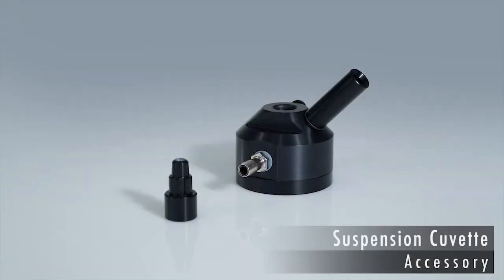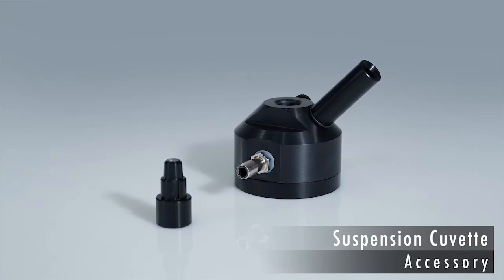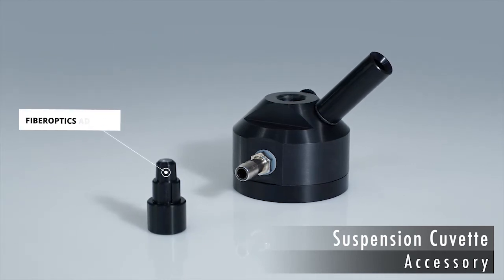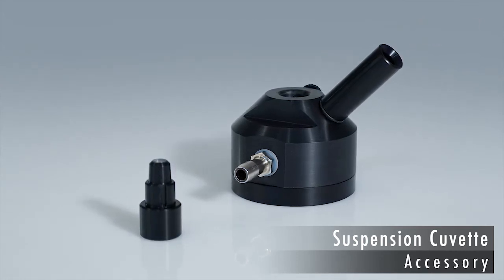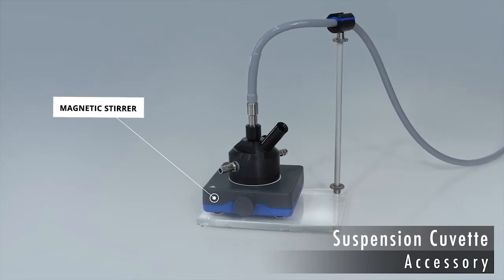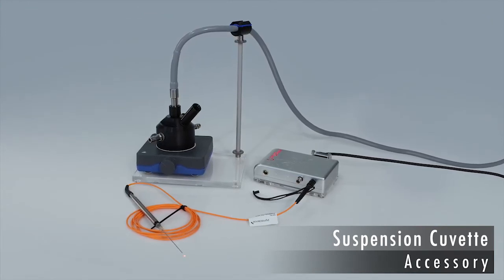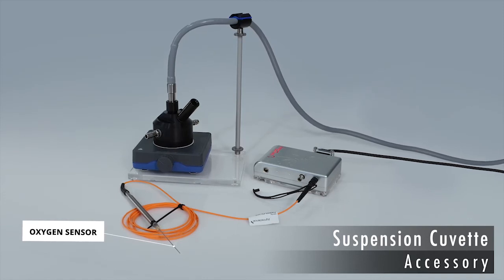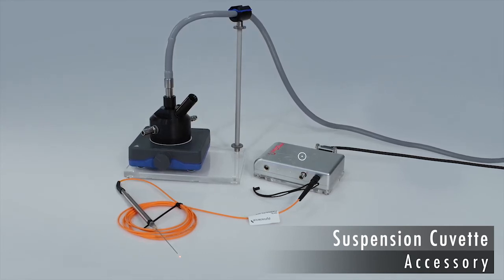The KS2500 Q-ET configures the MINI-PAM2 for investigating suspensions of cells and isolated chloroplasts. The Q-ET has a central reaction chamber; an adapter fits the fiber optics at the top, and a side port is tailored for adding chemicals with a microliter syringe. Constant temperature is achieved by a flow-through water bath, and a magnetic stirrer provides continuous mixing. The KS2500 Q-ET enables simultaneous analysis of photosynthesis by fluorescence and oxygen measurements; the needle-type oxygen sensor is inserted into the side port of the cuvette, with the oxygen signal acquired by an oxygen meter linked to the MINI-PAM2 via a special adapter.